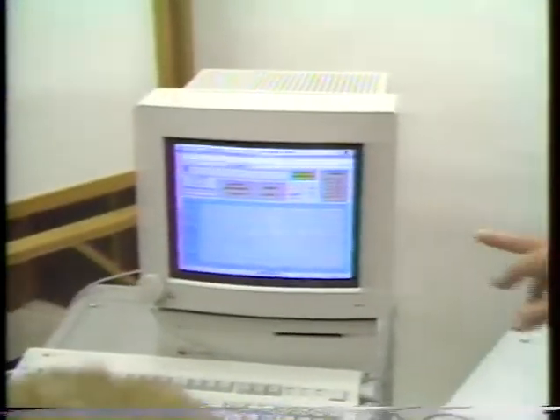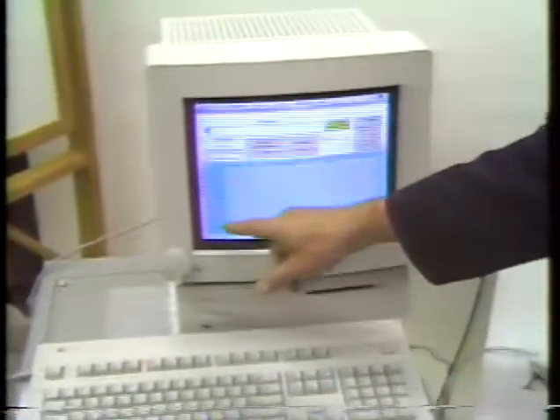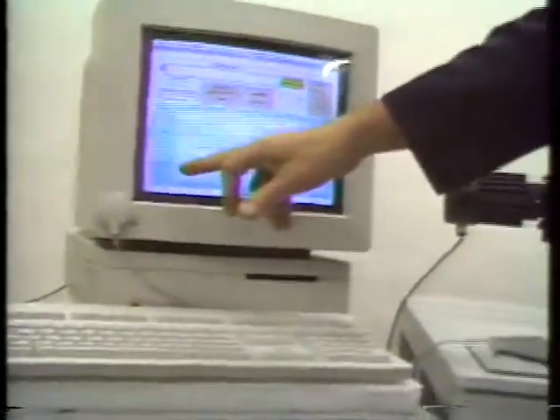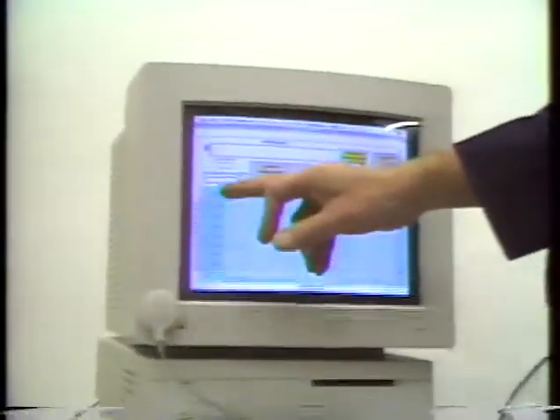Now this is a very interesting display, because on this side we see the noise of the baseline, or the baseline behavior, within 1% or less than 1% of noise. As we see on this scale, all these ripples are within the 1% range on the baseline.